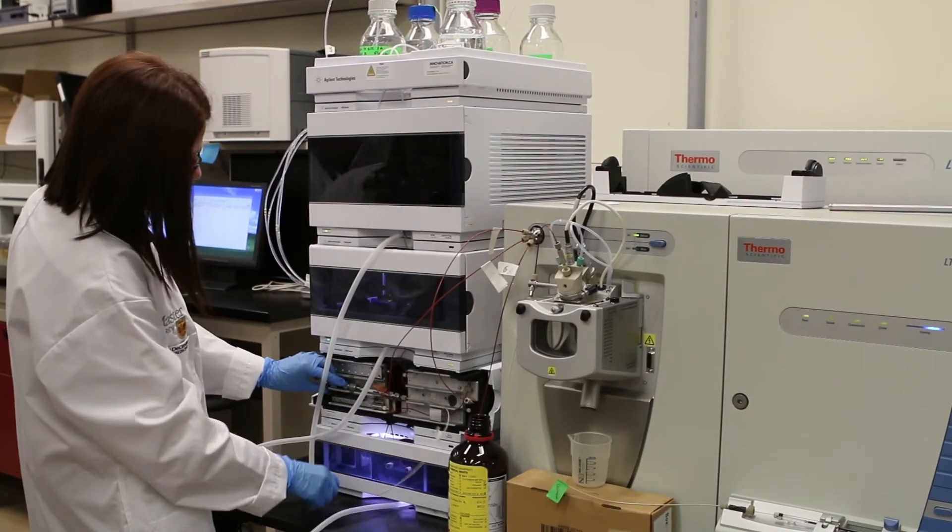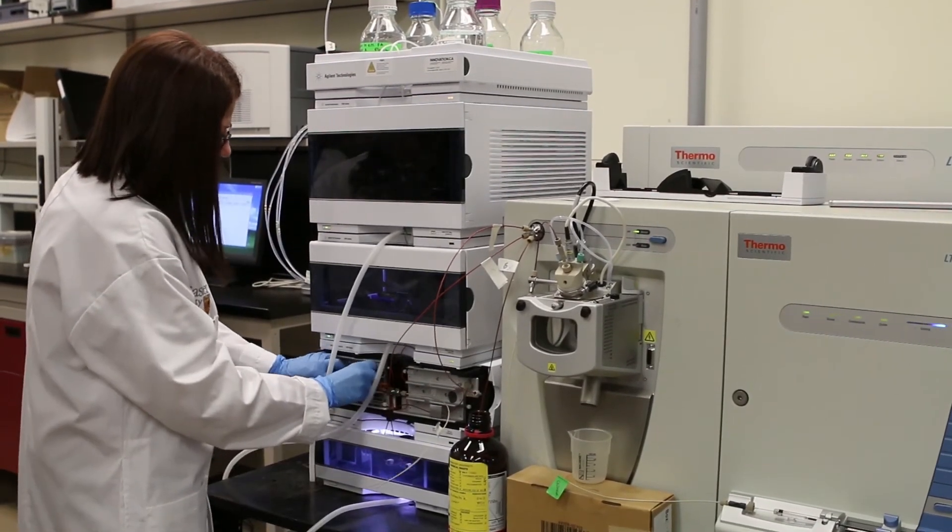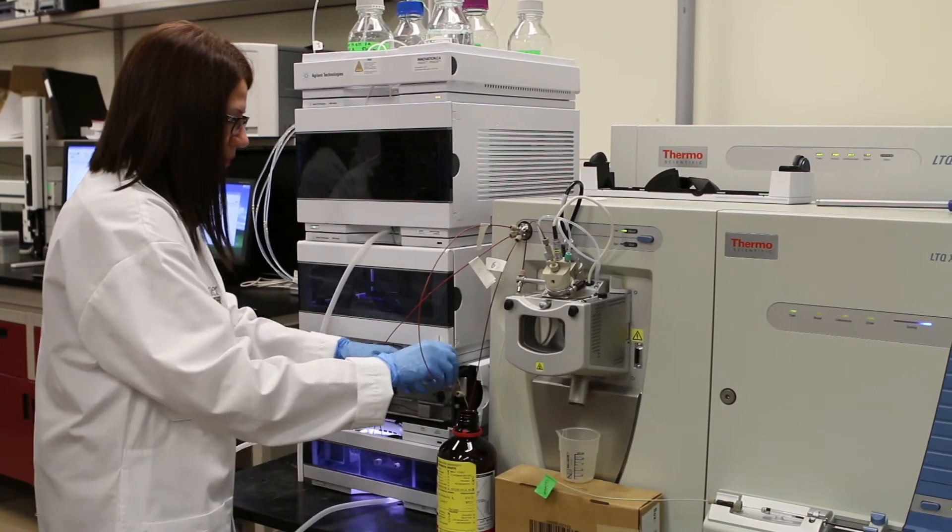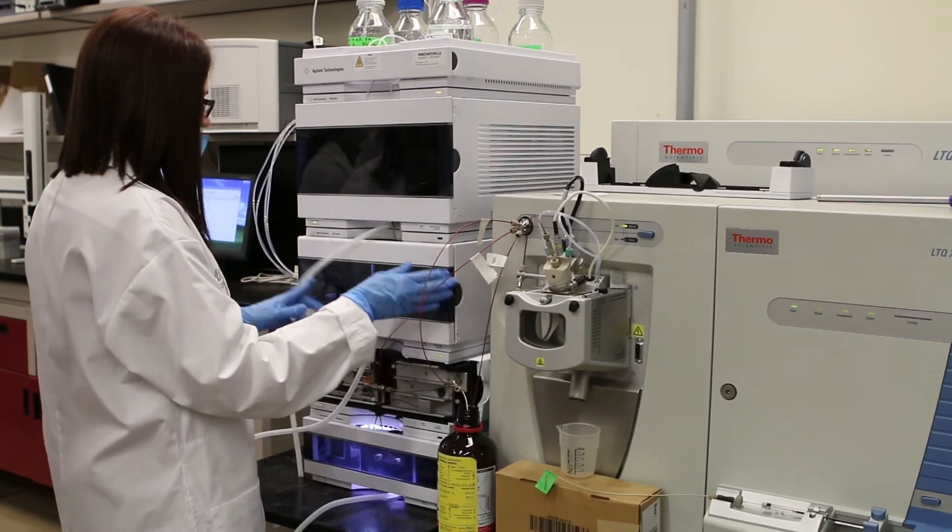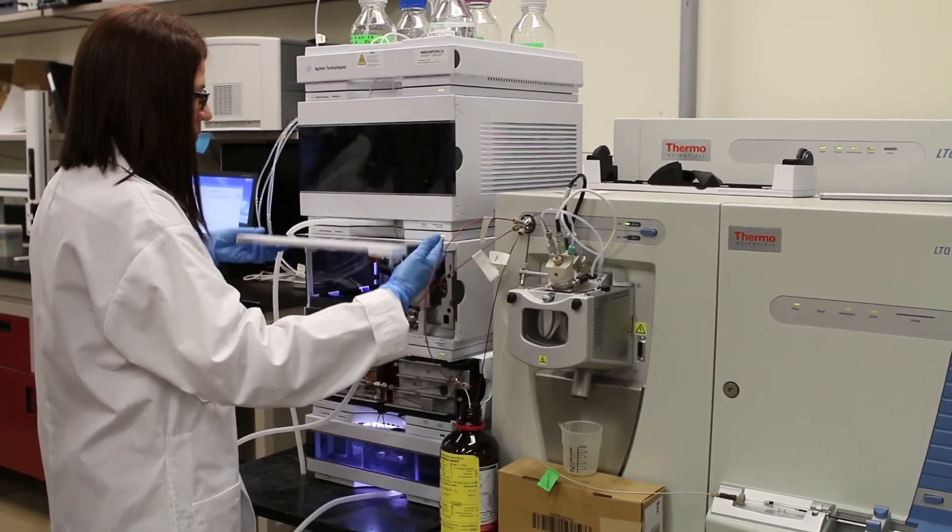In our mass spec area, we are focused on small molecules. Particularly, we are very good at targeted metabolomics type studies. We have both liquid chromatography and gas chromatography platforms that are available for our users, and we have a couple of different types of mass spectrometers. We're able to do fragmentation type studies. We have some that are very high resolution.